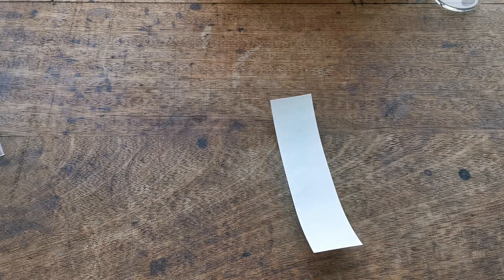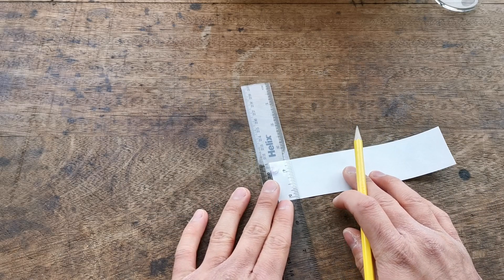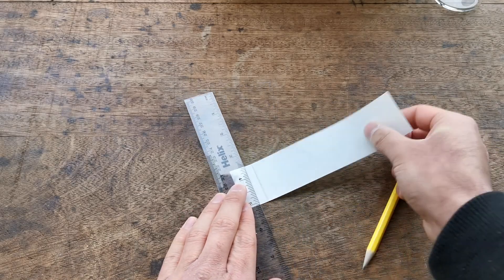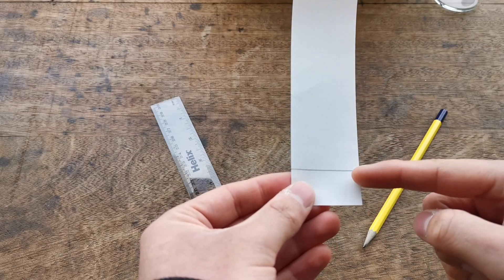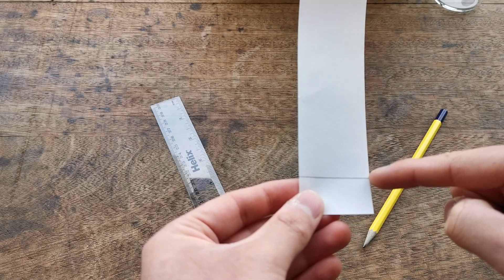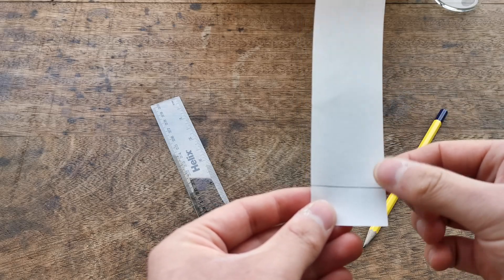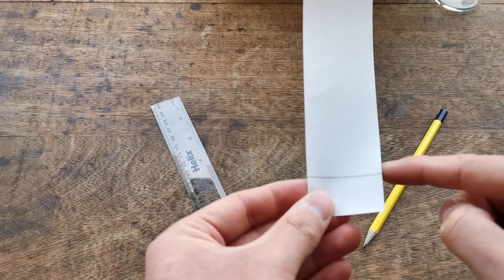To set up your chromatography paper, take a ruler and a pencil and draw a straight line about two centimeters above the bottom of the paper. You do not want to use ink for this line because it can run up the paper with the solvent. The pencil is insoluble and will not run, but pen can dissolve into the solvent and may be carried up, so we have to use pencil.